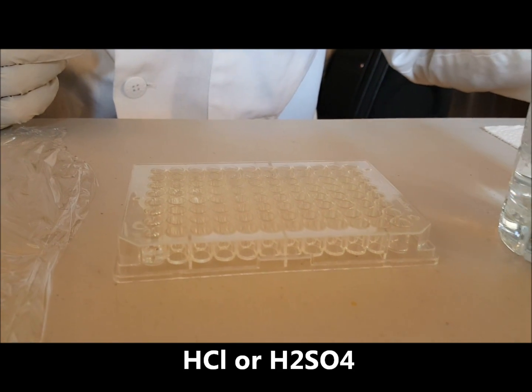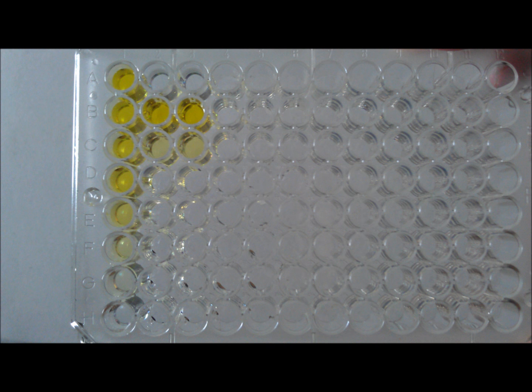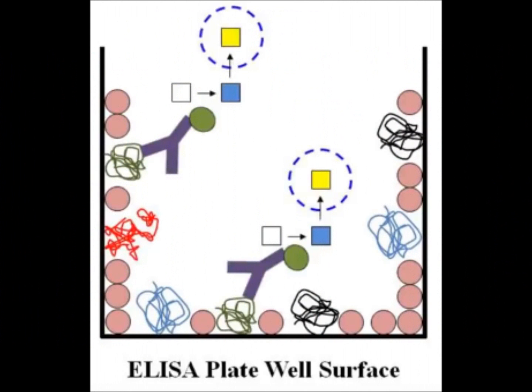To stop this reaction from continuing, an acid is added in, which immediately causes the blue color to turn into a yellow color. This is what it looks like at the molecular level.